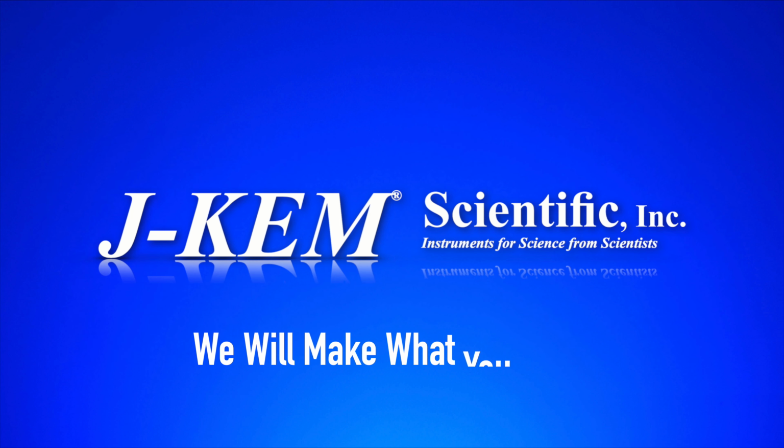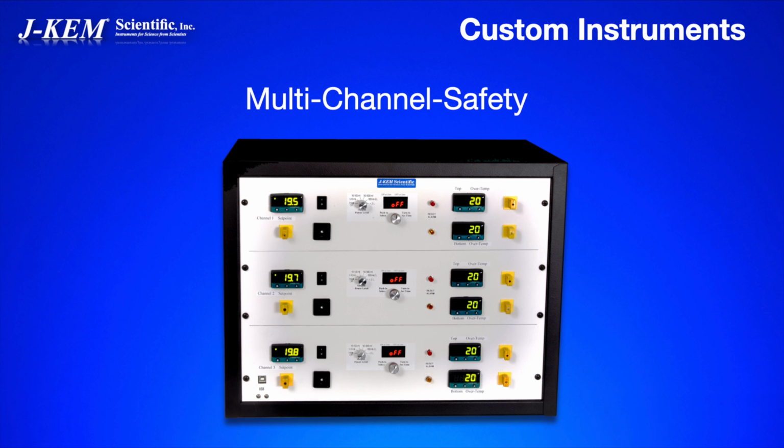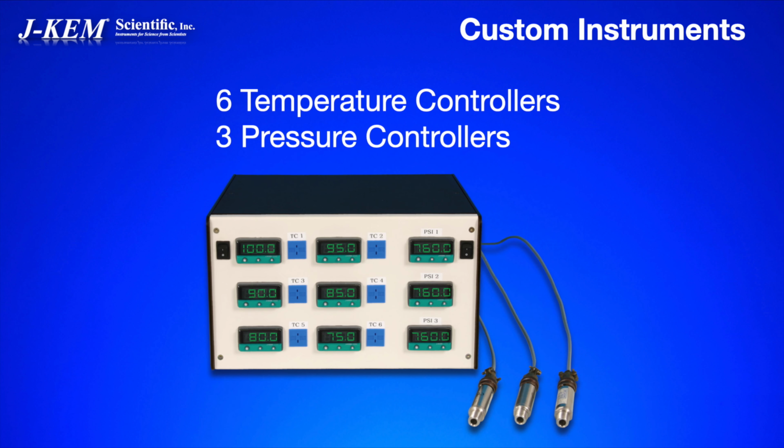The last thing to understand about J-KEM is we don't just make the standard temperature controllers that you can see in our catalog. We make custom controllers. We will make the temperature controller that you need for your application. We have had people who needed, for example, a cell phone dialer on it. So if something went wrong with the reaction, it called their cell phone at 2 a.m. We've put on custom safety features. We often run into clients who want to control both temperature and pressure. So we've put in a single unit a temperature controller, the flask, and a vacuum or a pressure controller for the reactor. We can build that into the same unit.